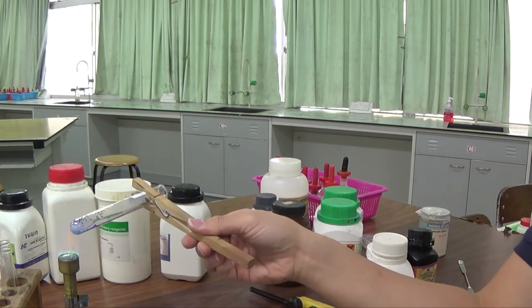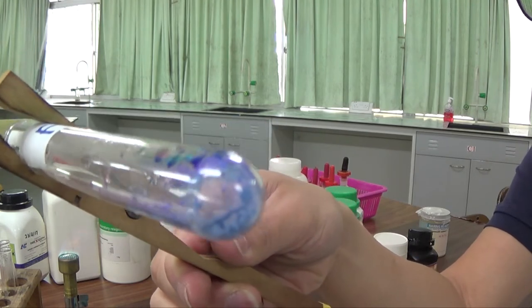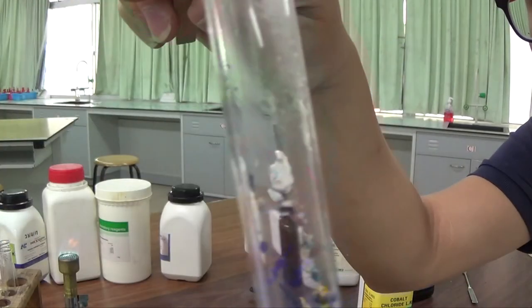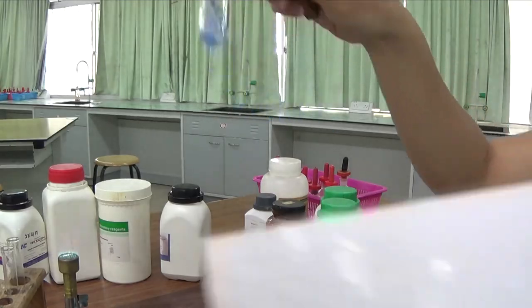So what do we see? The solid is no longer pink, it is blue. And what else do you see? You see colorless liquid. I don't know how clear it is. You see a colorless liquid form on the upper part of the tube because there's condensation inside and it is not colored. The solid is colored, but the liquid is not colored.